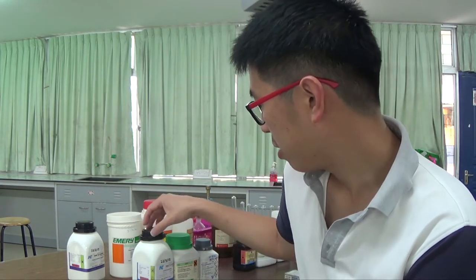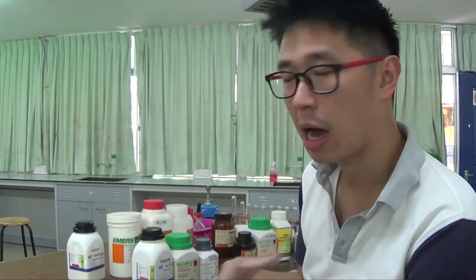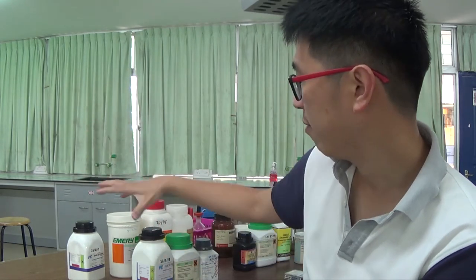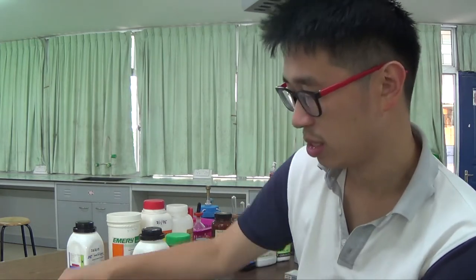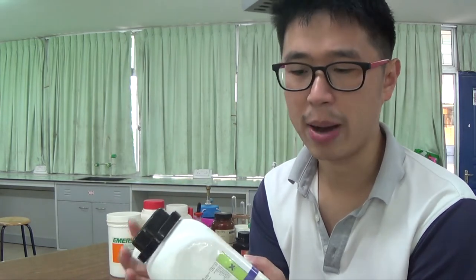In this tutorial video, I'll go through some qualitative analysis. I've got a bunch of chemicals here behind me. I was thinking how best to categorize qualitative analysis of these chemicals. The first thing that comes to mind is water of crystallization. Water of crystallization is basically H2O, water, and it co-crystallizes together with the compound itself.